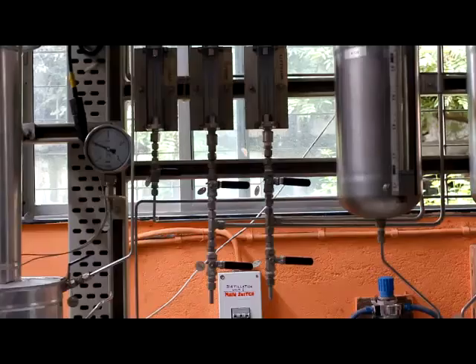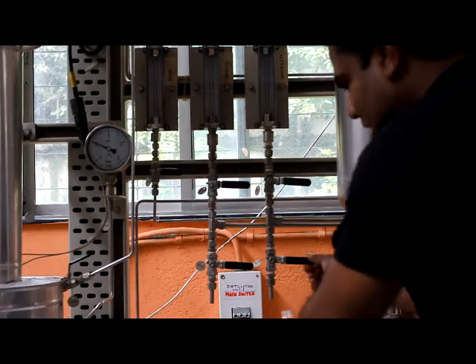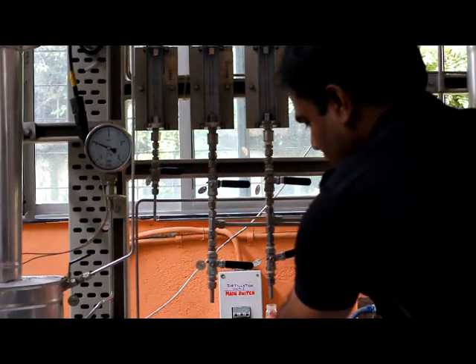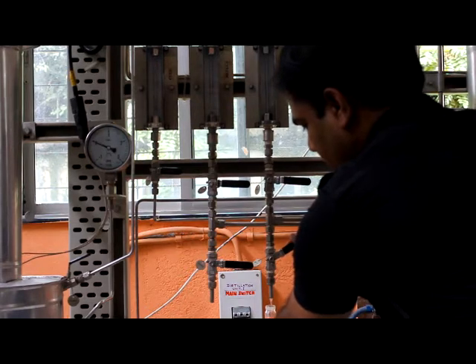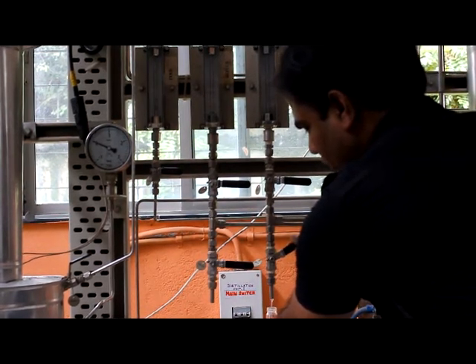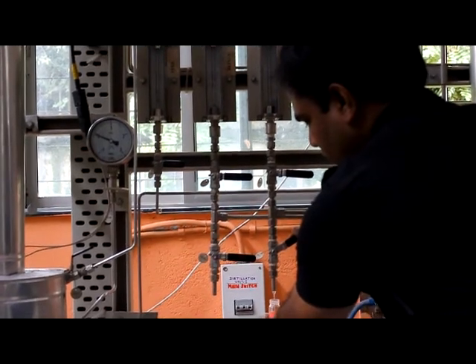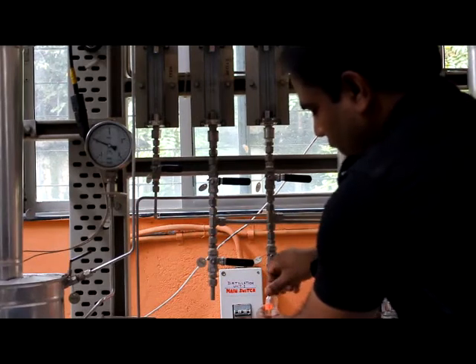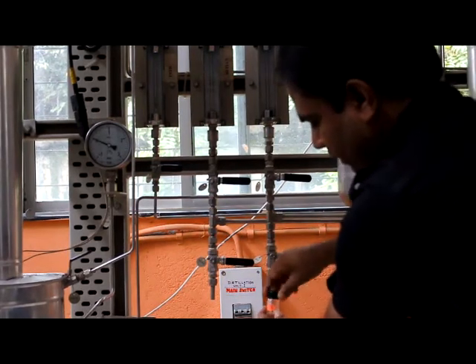Now you have to collect the sample of distillate from here. Slightly open the valve and take the sample, around 2 milliliters. Then close it properly. This is our distillate sample.